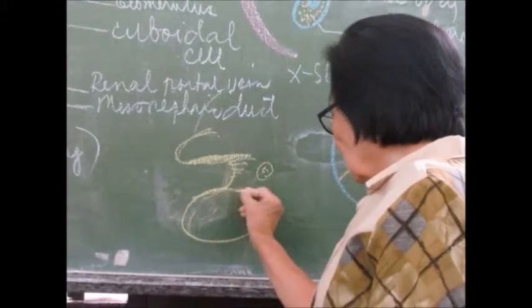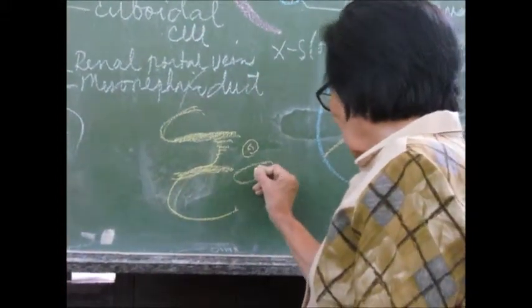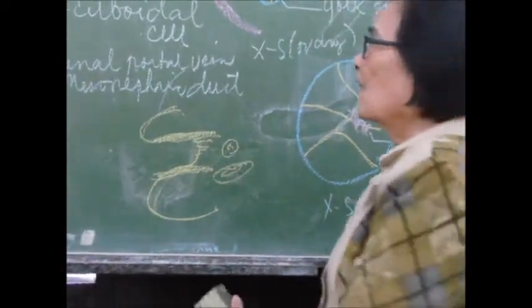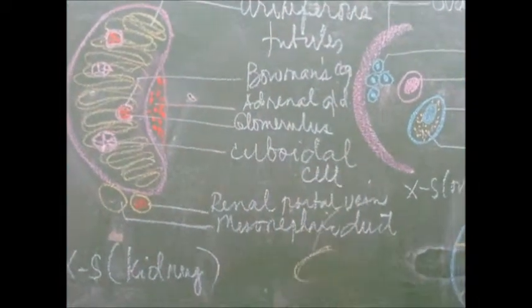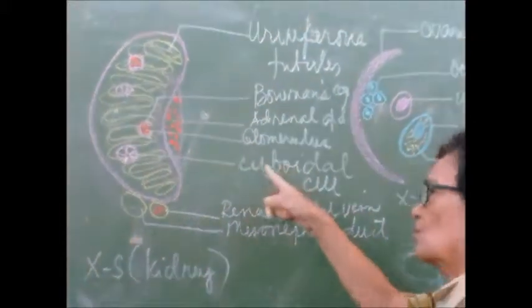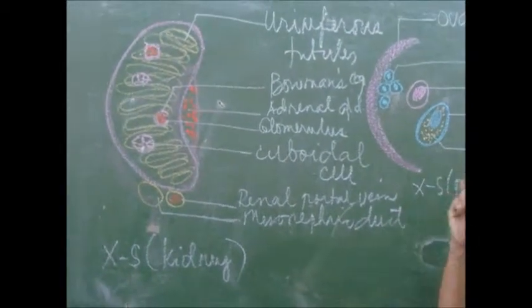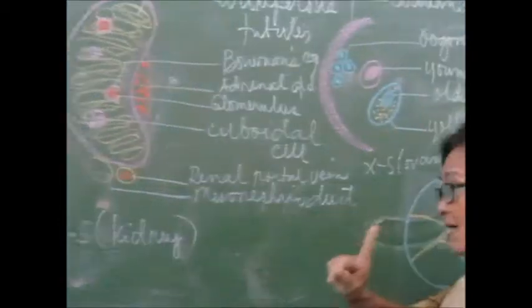Now, what about if it occurs along the curvature? So, it will be something like oval, right? Now, however, this is a diagrammatic representation. All of this represents the millions of very tiny tubes in our kidneys. Our kidneys will extract the soluble waste product from the blood.